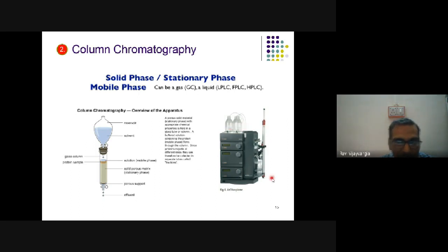It is not visible here, but there is the sample injection port, where you can inject the sample. Also the buffer: because the pump is there, the buffer flow rate can be controlled by the pump, and it will pump the buffer into the column. Also, the collection of the sample can be done automatically. Here it is not, but an automatic fraction collector also can be added to the system, so that will collect the fractions for you.